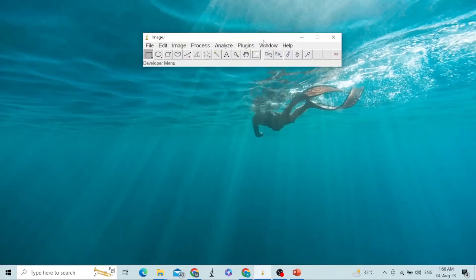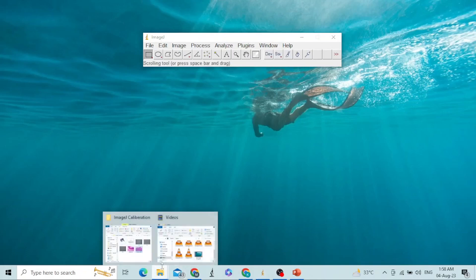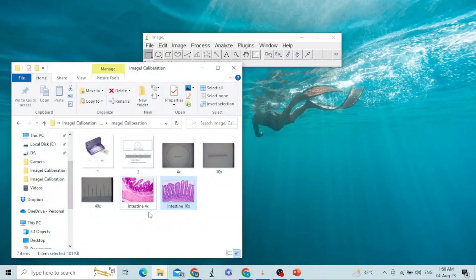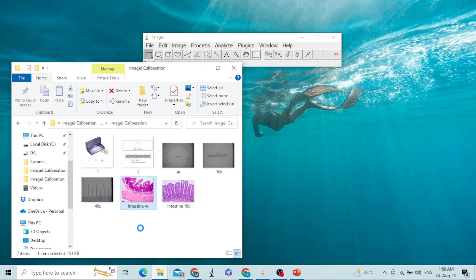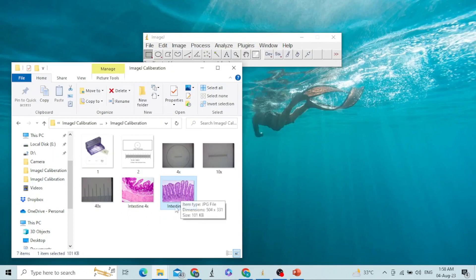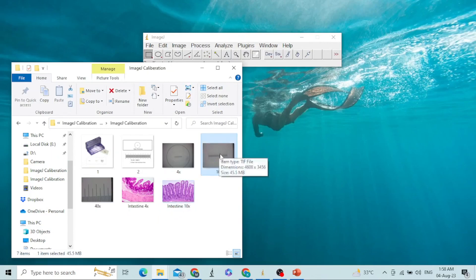So far we have seen what is a stage micrometer. Now we will see how ImageJ will be calibrated. For the calibration of ImageJ, we have to use our actual images. For example, I have one image of intestine taken at 4x and another image taken at 10x. Since I am interested to measure dimensions at 10x, I will use the stage micrometer image taken at 10x.